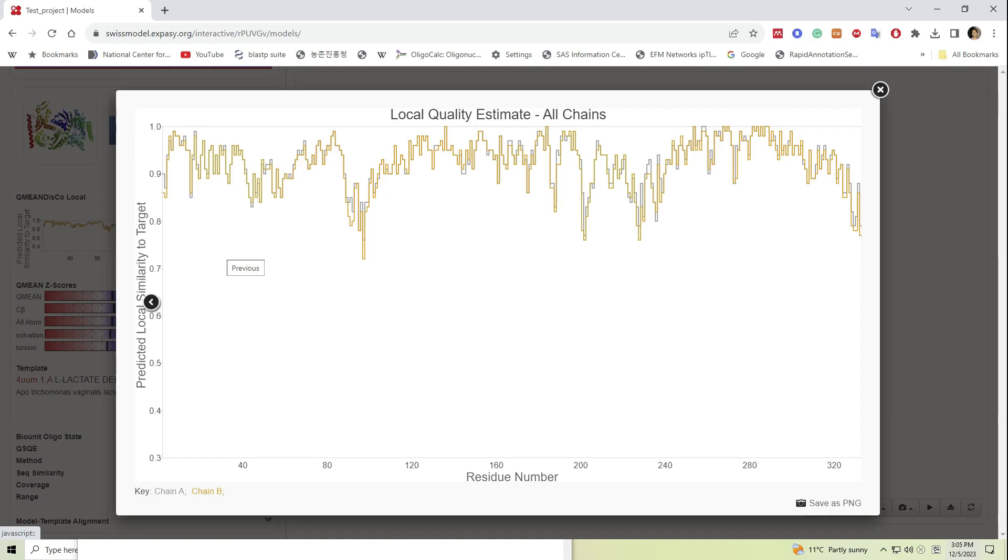The local quality estimate, all chains, provides the residue-wise local similarity to the targets of all chains. Here we can observe which residue has the highest score and which consists of the lower score values.